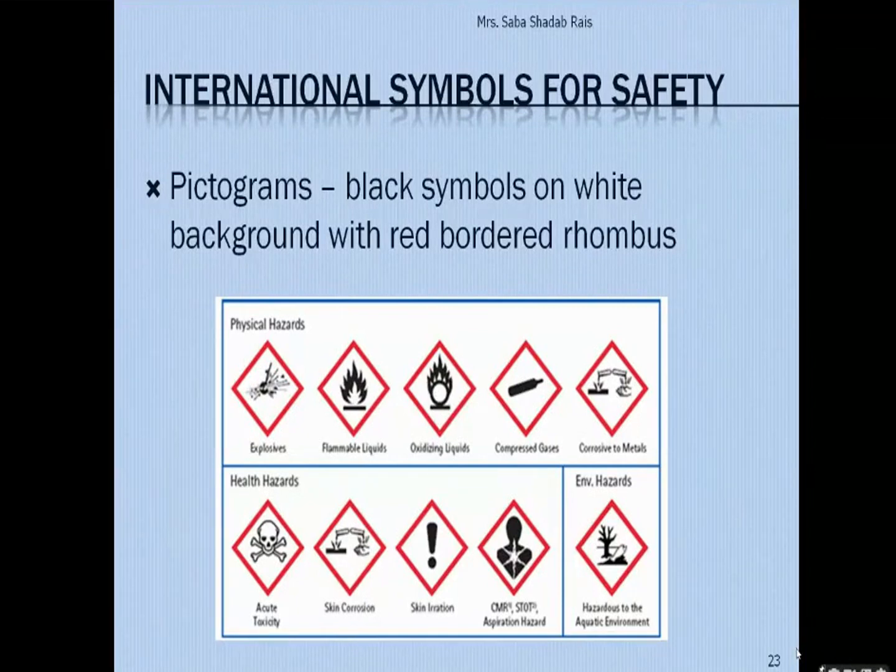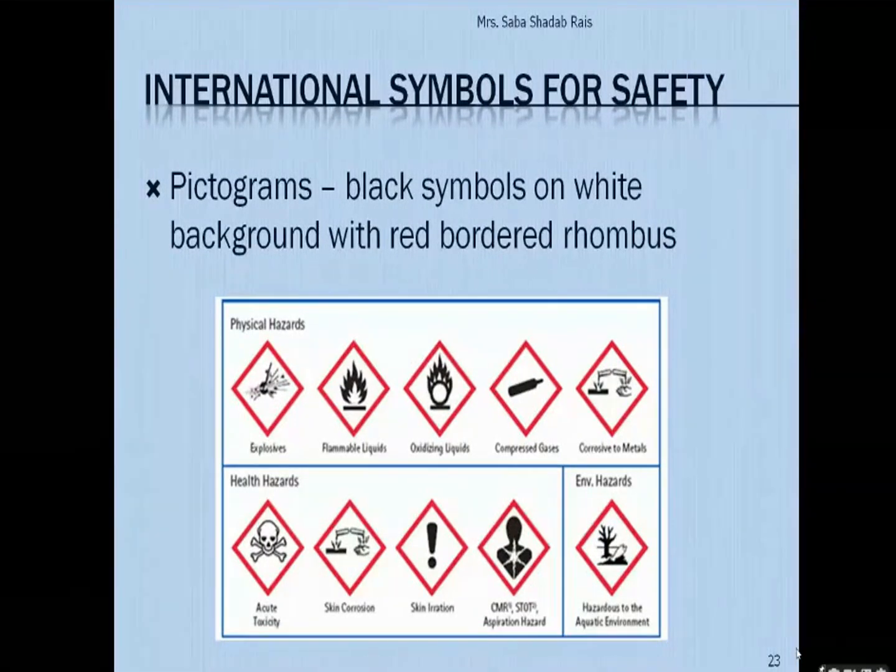You must be aware of all these things before entering the lab, because initially I told you that the lab is a very useful place to perform practicals, but it can be the most hazardous place if you do not handle the laboratory things or chemicals in a proper way.